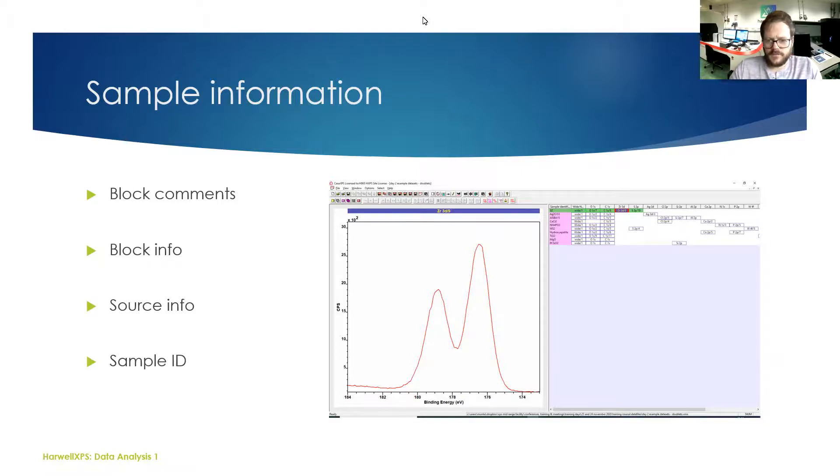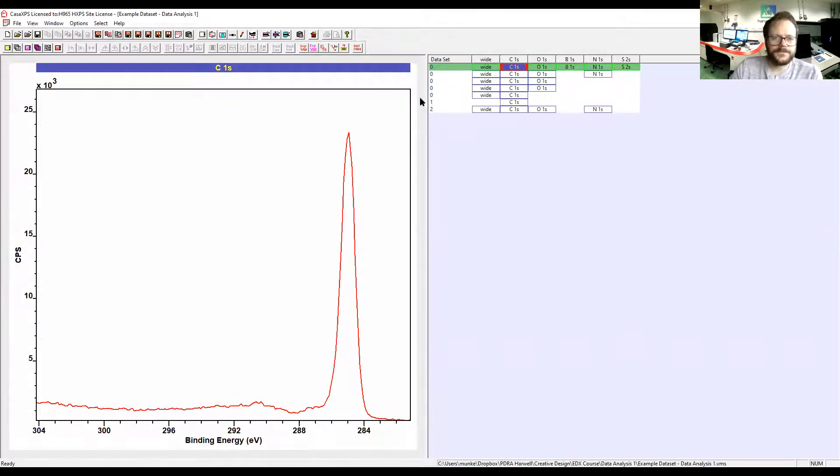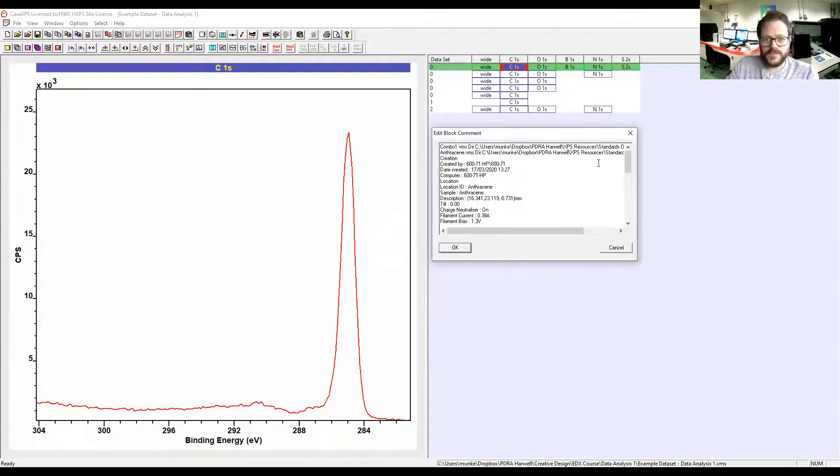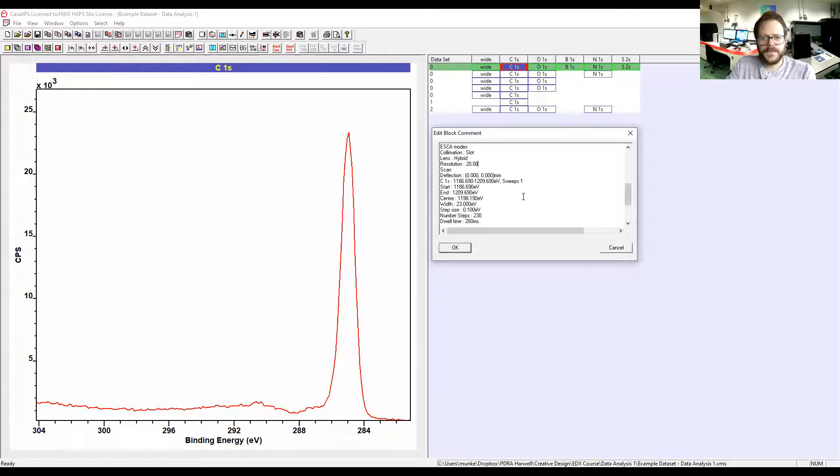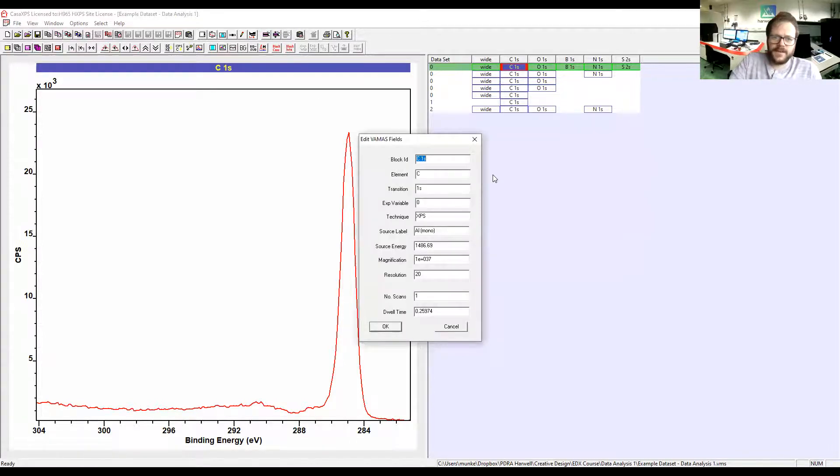I'm just going to switch to our software now. Here we're just going to click on the spectra to open up these options. First I'm going to open up the comments. The comments has got all kinds of information that you could possibly want. If we look down here we have the sample name, we've even got the stage coordinates it was recorded at, the neutralizer settings, our emission current, the pass energy, the dwell time, and the number of sweeps. In Block Info, it's in a slightly tidier table fashion, and again you've got all of this information available.